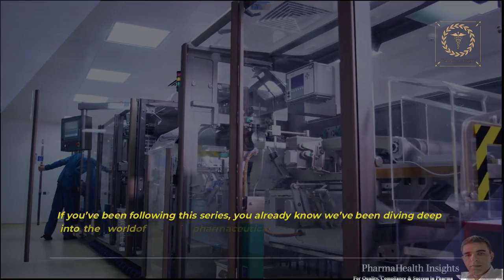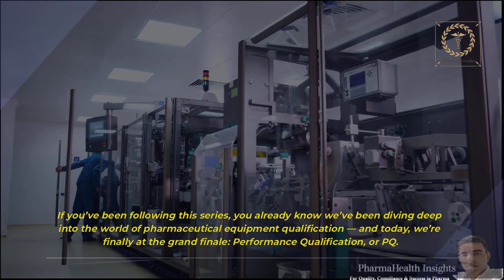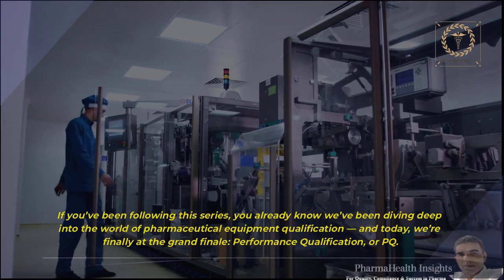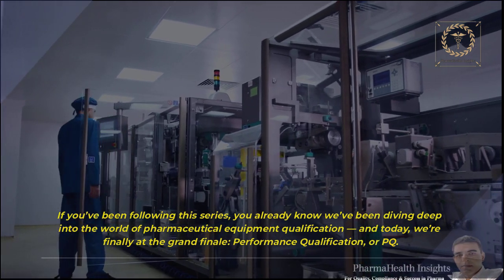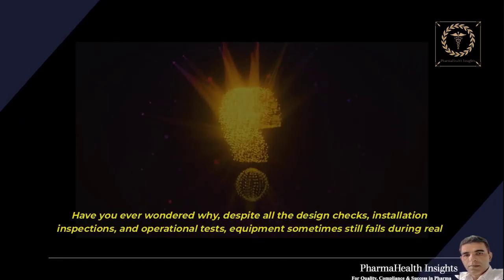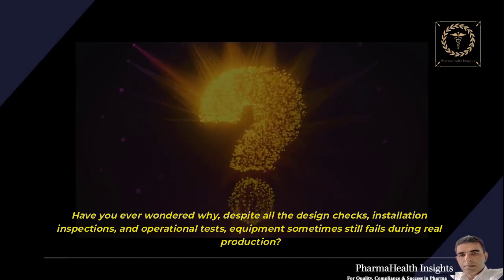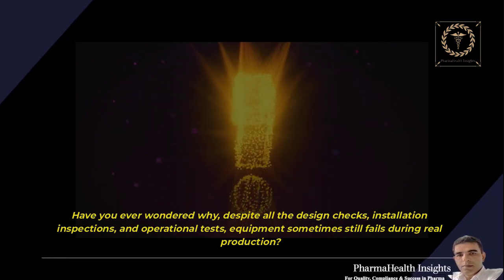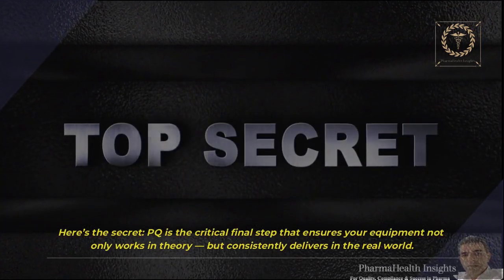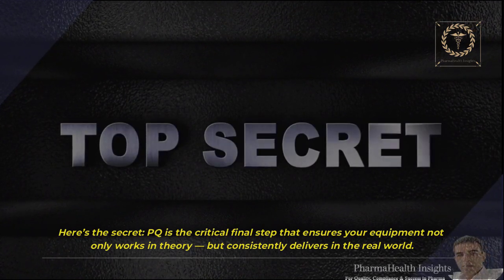If you've been following this series, you already know we've been diving deep into the world of pharmaceutical equipment qualification, and today, we're finally at the grand finale, Performance Qualification, or PQ. Now let me ask you, have you ever wondered why, despite all the design checks, installation inspections, and operational tests, equipment sometimes still fails during real production? Here's the secret. PQ is the critical final step that ensures your equipment not only works in theory, but consistently delivers in the real world.